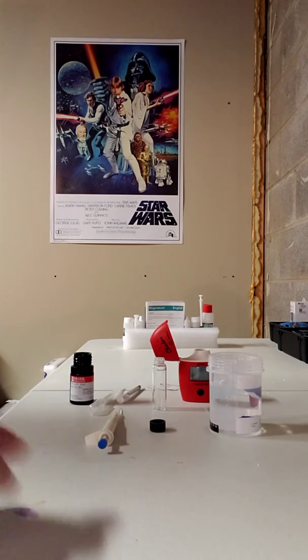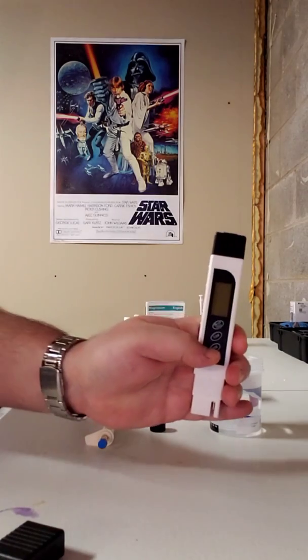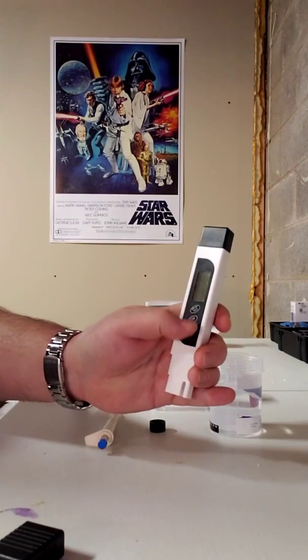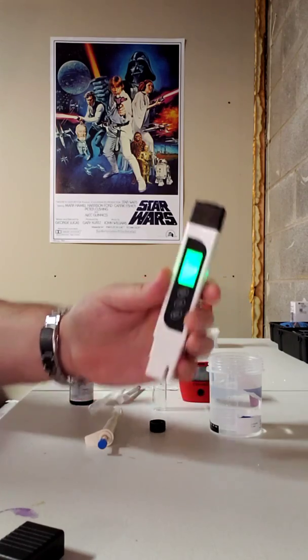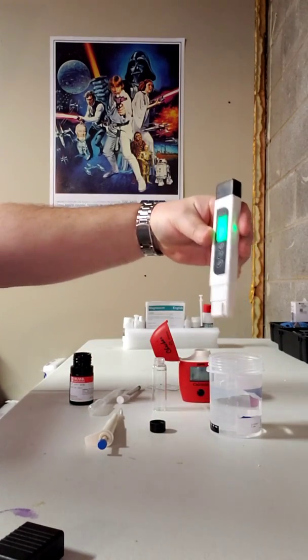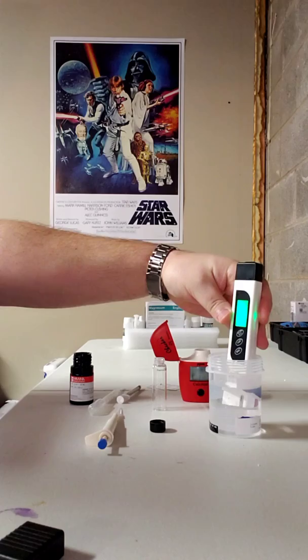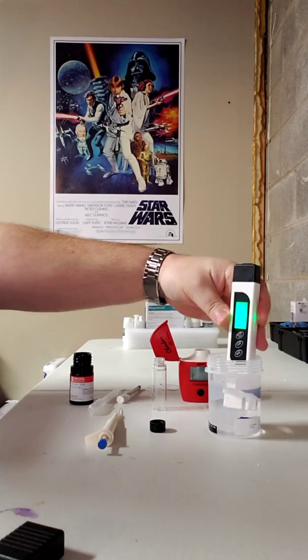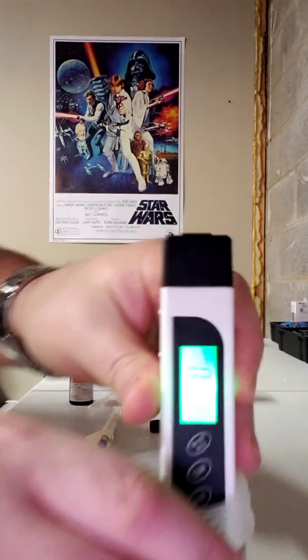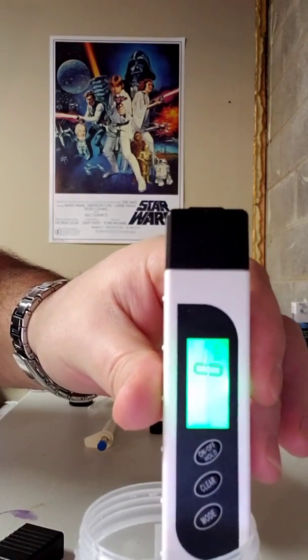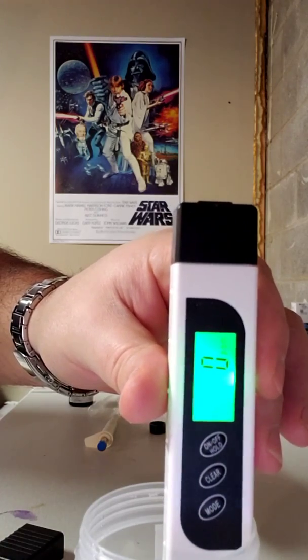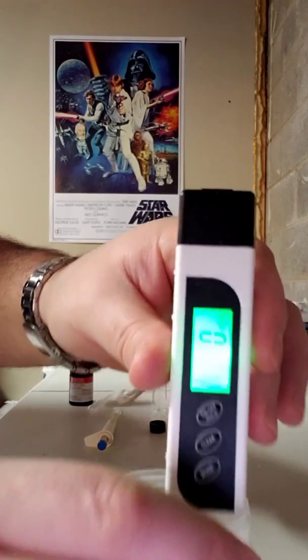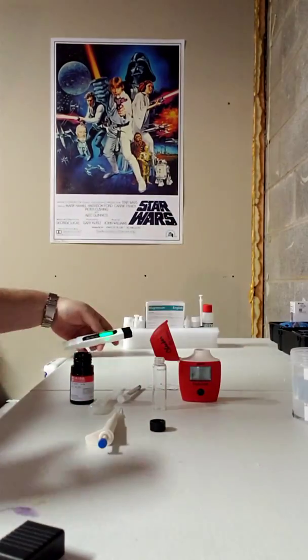So just to make sure, I do have my handy dandy little TDS meter here because you definitely want this to be zero TDS. So I'm going to dip this in here. And as you can see, zero TDS in my RODI water. So that's a good start.